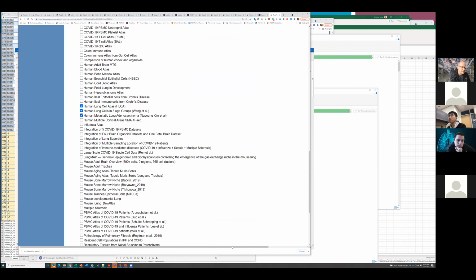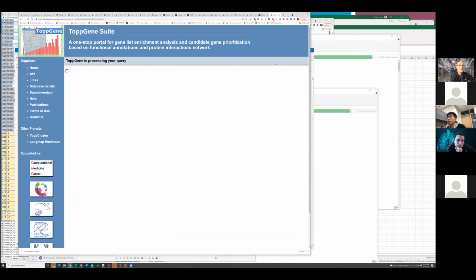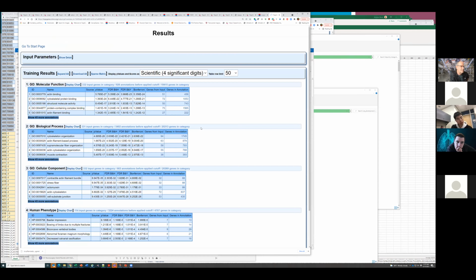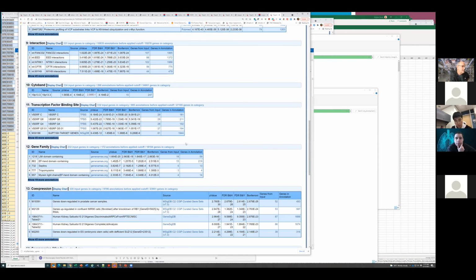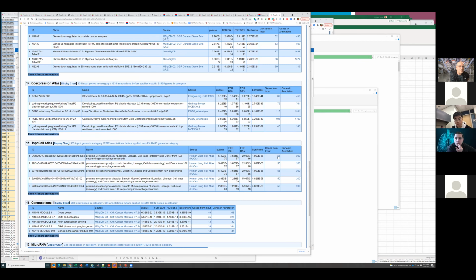Now basically you'll see the overlaps to the ToppCell signatures, and then you can go right to those heat maps and paste on the new columns for that proteomic data. What paper was that, Bruce? That was the sorted human cells proteomics data that you guys released.